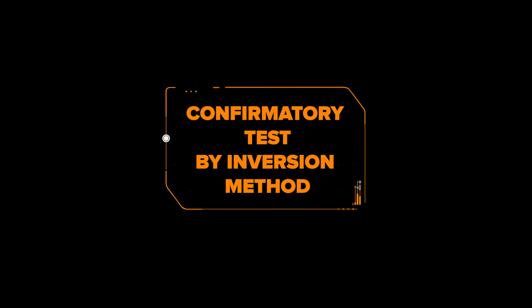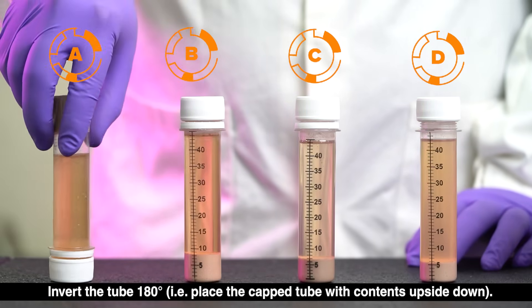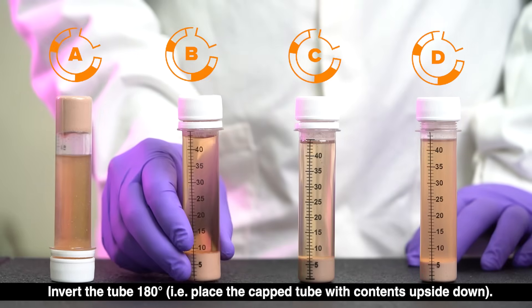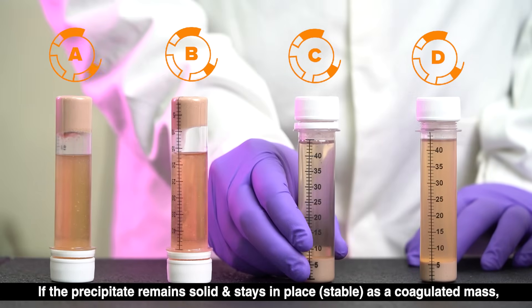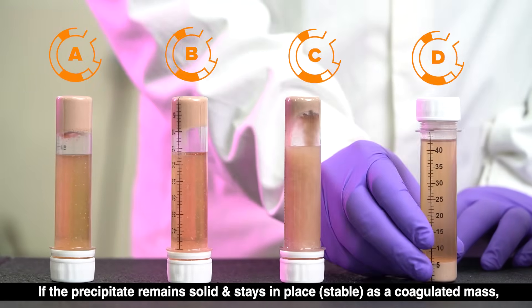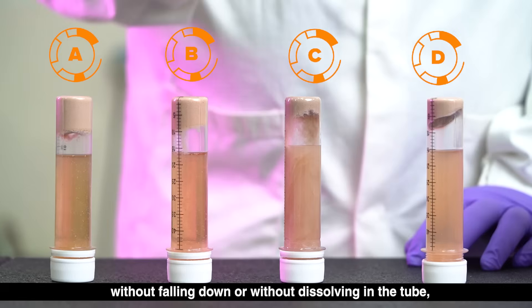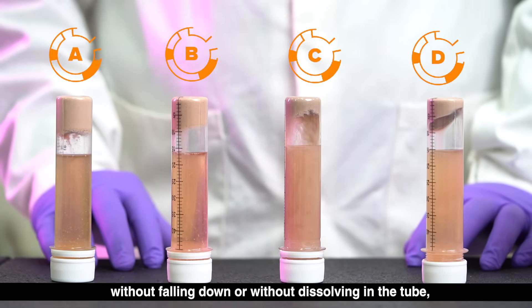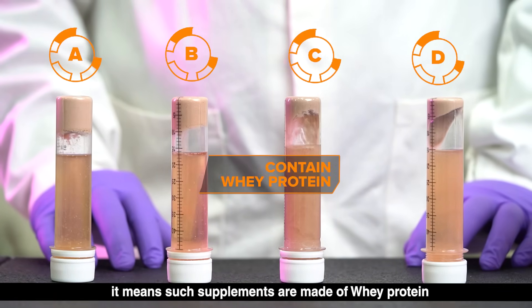We can perform a confirmatory test by the inversion method. Invert the tube 180 degrees — that is, place the capped tube with contents upside down. If the precipitate remains solid and stays in place, stable as a coagulated mass without falling down or dissolving in the tube, it means such supplements are made of whey protein.